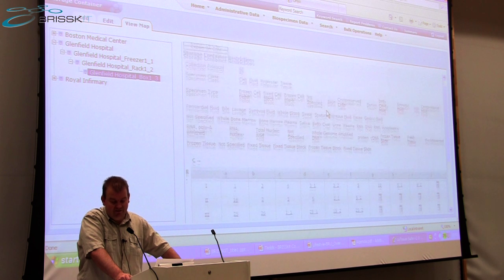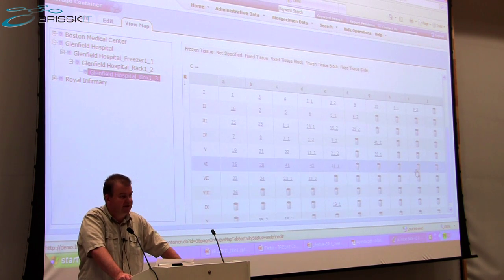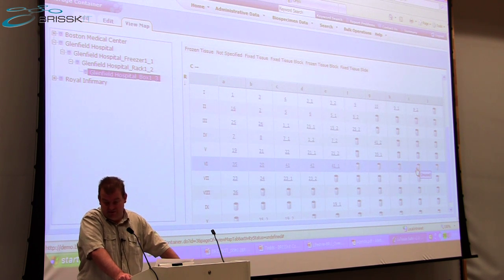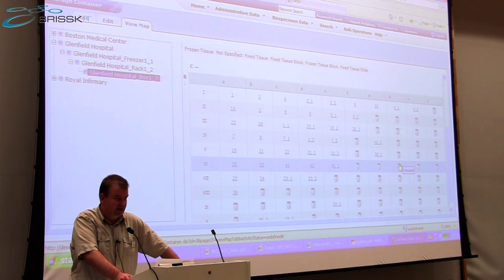And that's, again, very configurable, and one of the key reasons why we picked up CA Tissue as part of our solution for studies within the BRU. So that's showing you the individual samples stored against particular participants within a study, held in a particular box, particular rack, particular freezer, particular site.